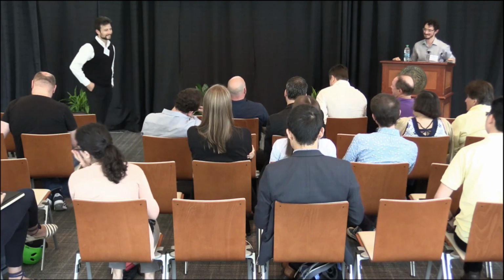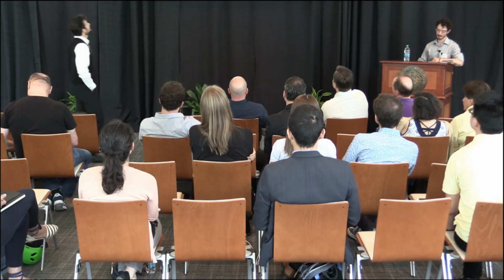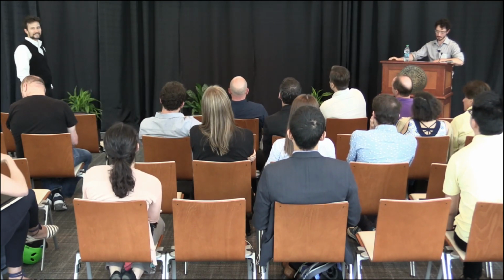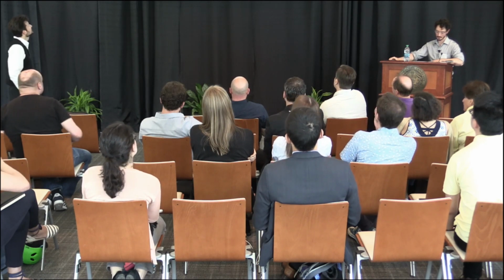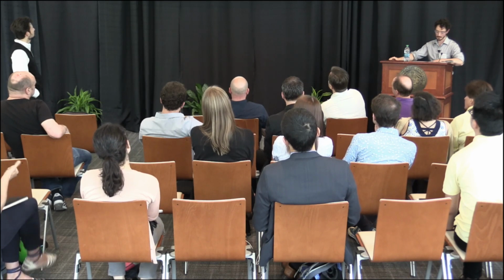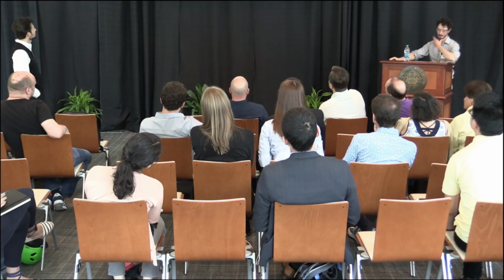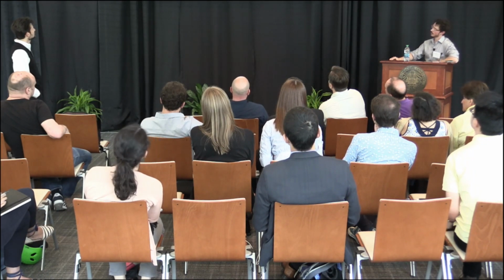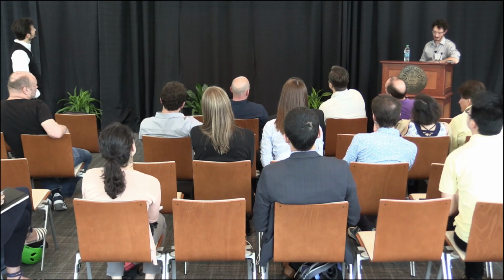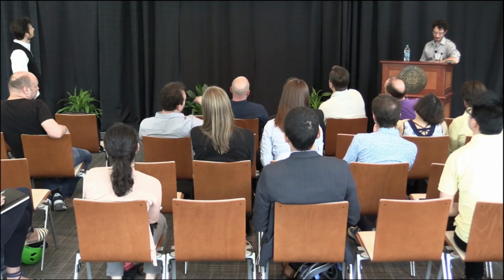Very interesting. 2 questions. When you go back to your correlation matrix of your 18-hour and your 3-hour, your 3 hours look better correlated to each other than the 18 hours to themselves, yet your same samples between 3 and 18 hours look vastly different on this scale. Do you have any idea why 3 hours correlates with each other better than the 18 hours do?